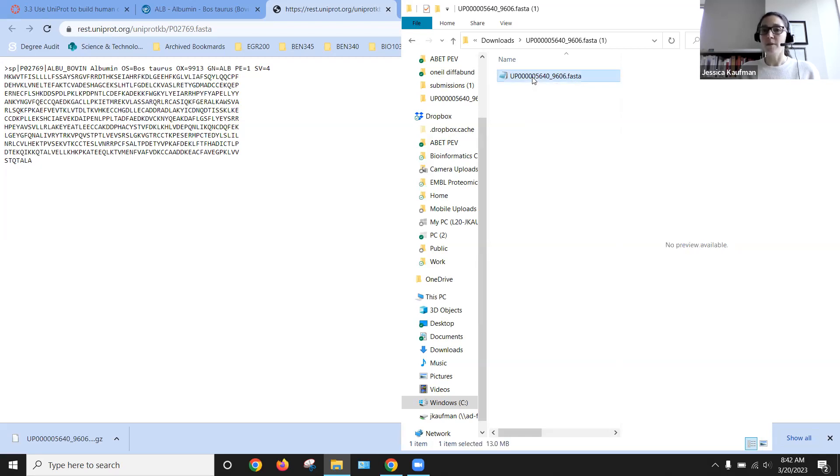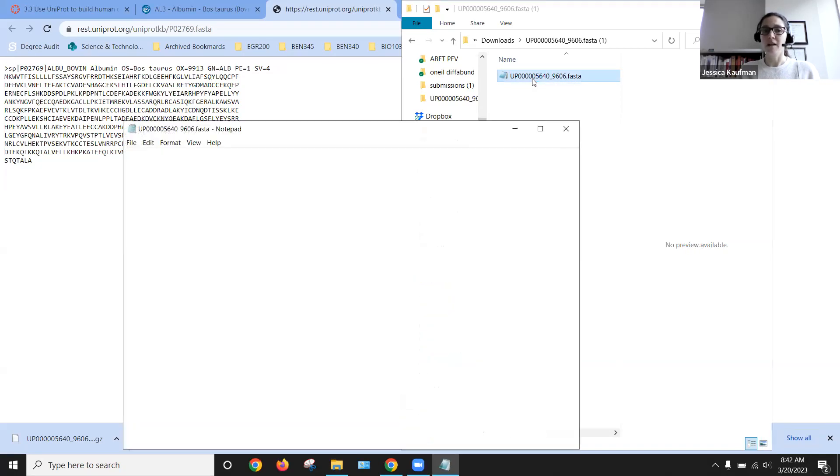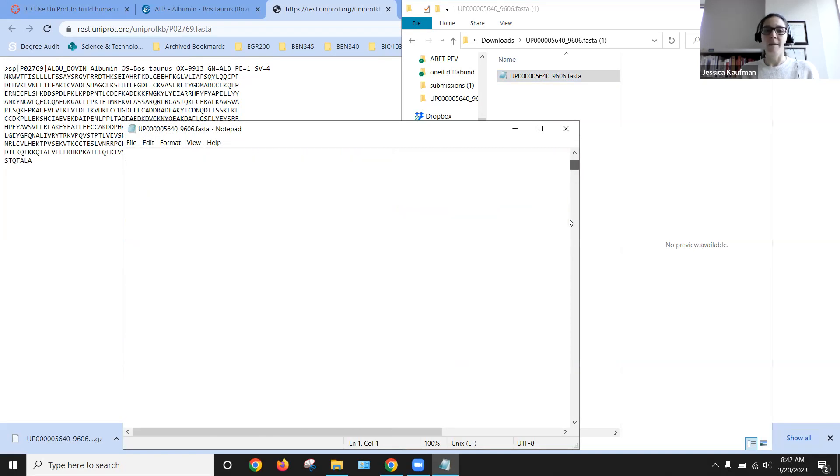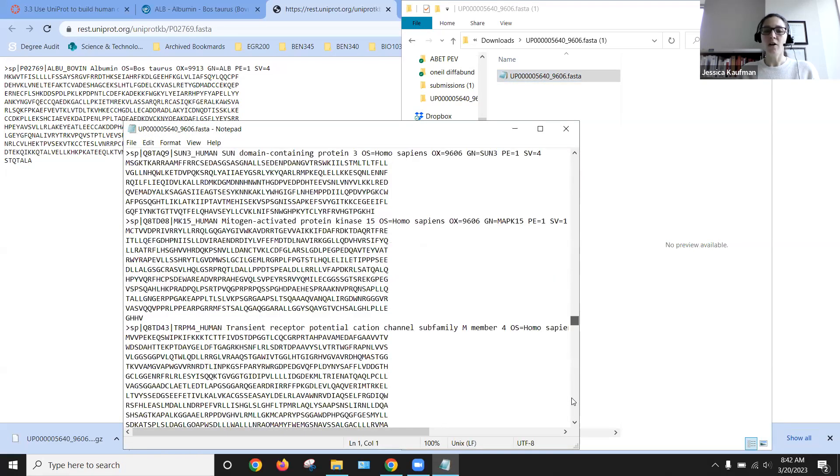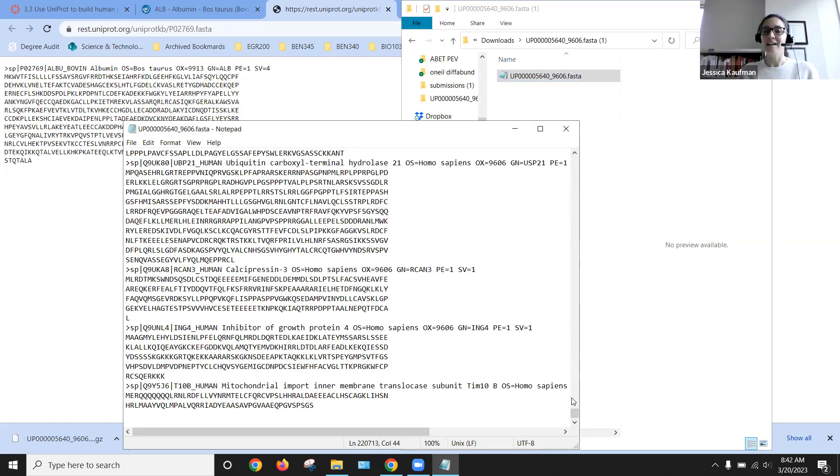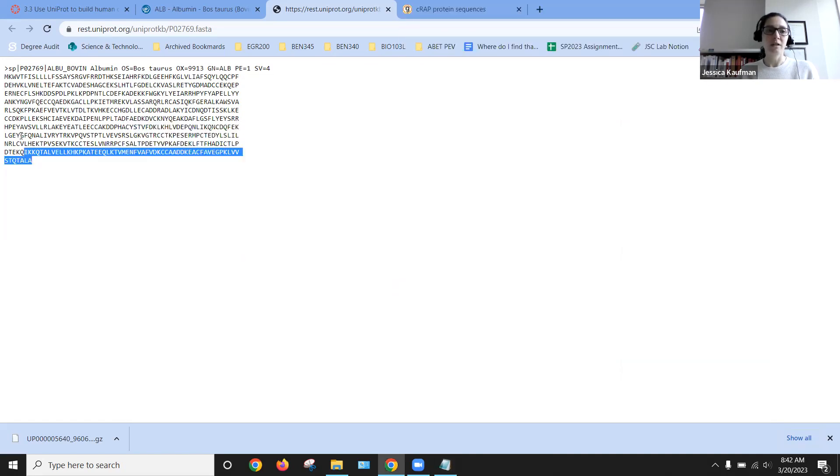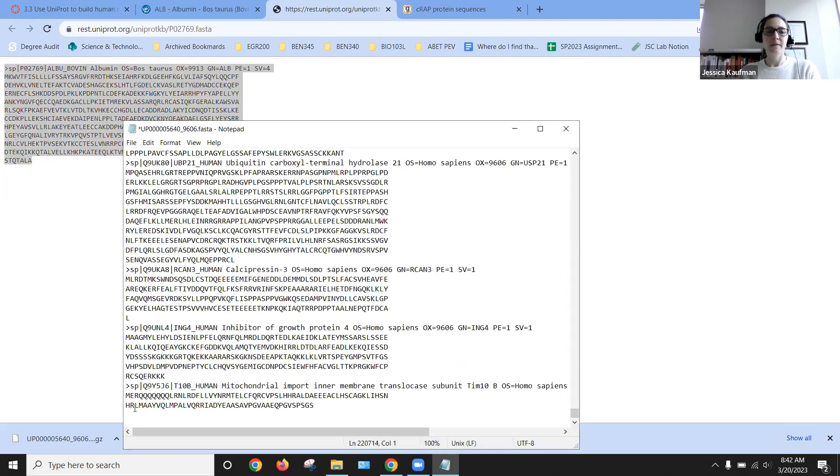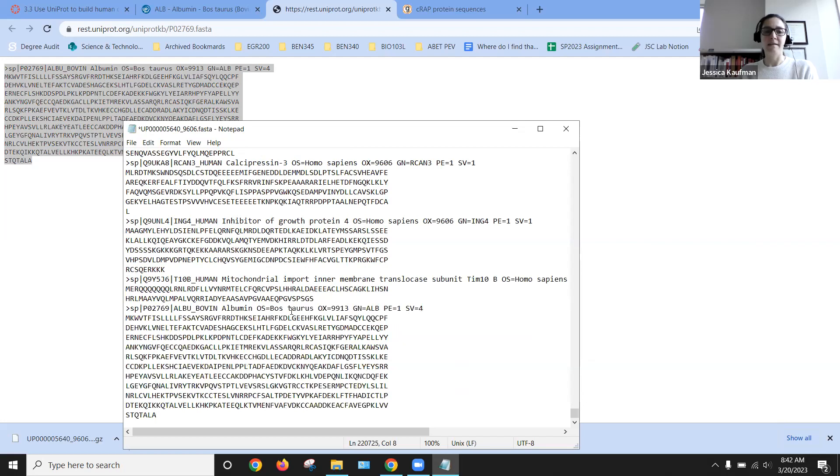I'm just going to open this up on Notepad. I can see it's a very large file and I can scroll all the way to the bottom to add my non-human sequence. So I'm just going to hit return, go to the web browser, copy the sequence and paste it in.